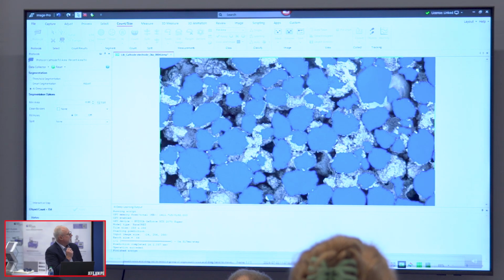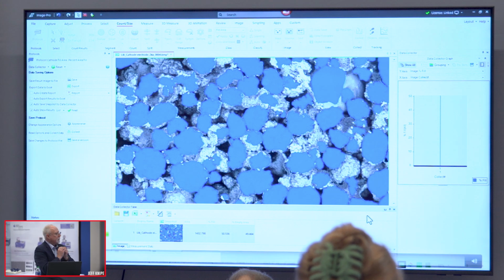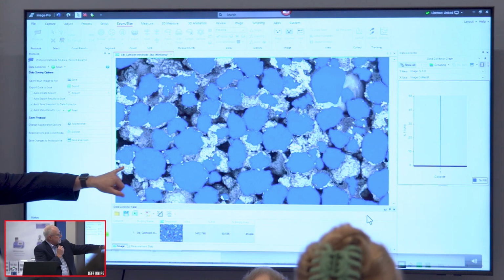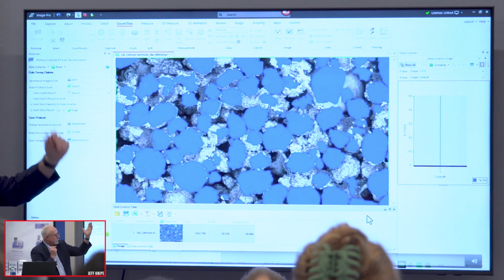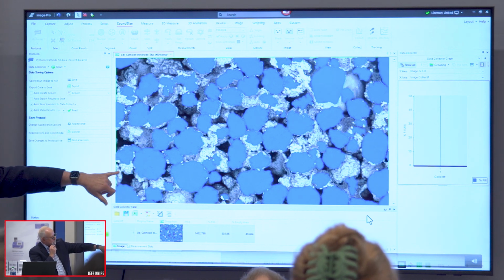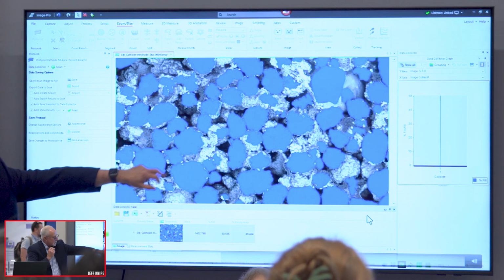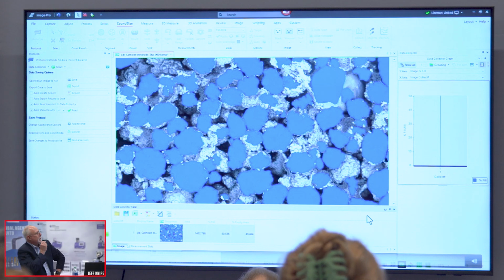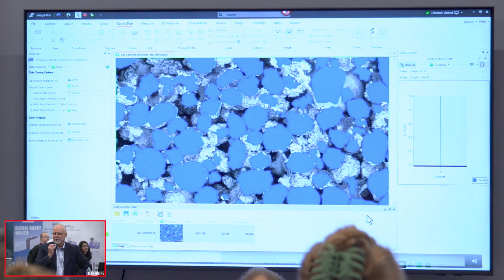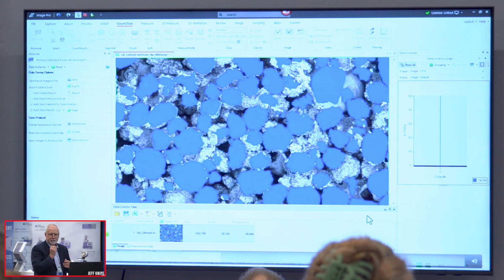And so now, I'm just going to pause that one more time. So anything that's close, but still below that surface where it's been microtomed or cross-section, so we're ignoring all of that. This one's a little close, judgment call there about that spot, but now you can accurately identify areas or make calculations that are challenging using normal traditional segmentation methods.